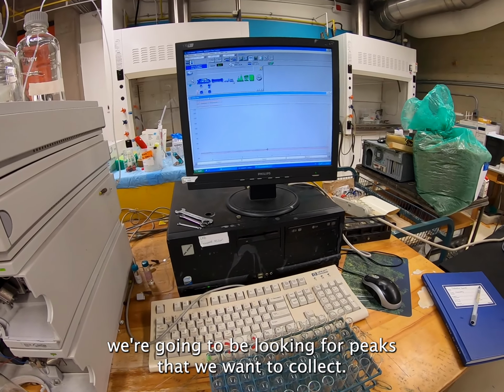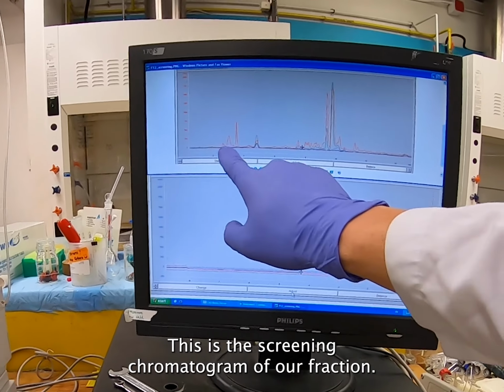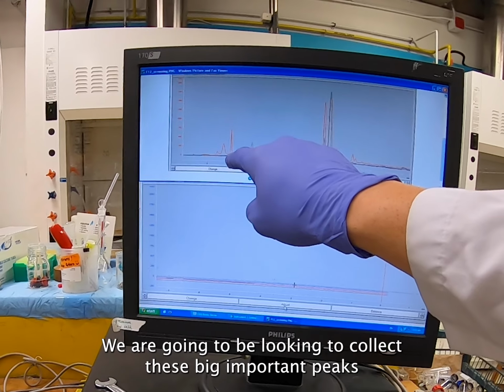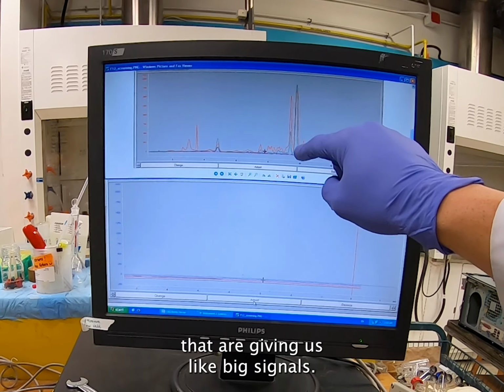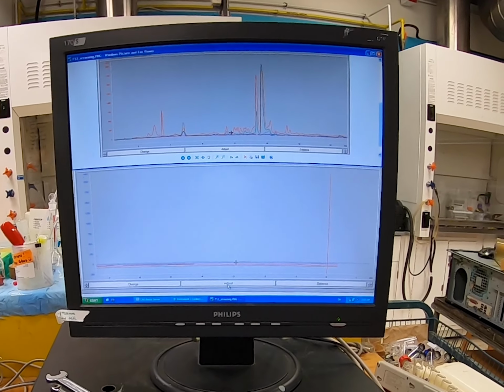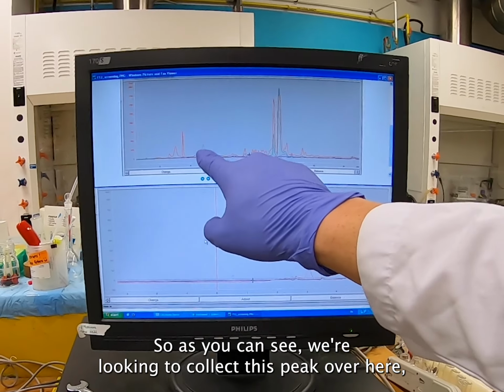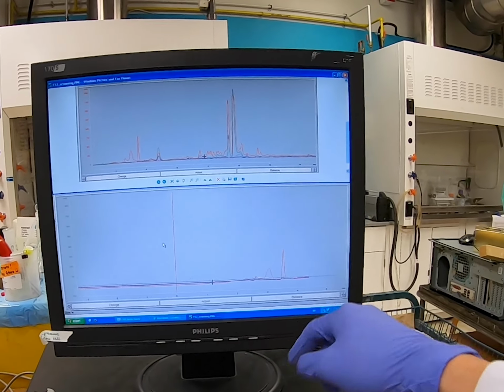And now we're gonna be looking for peaks that we wanna collect. This is the screening chromatogram of our fraction. We're gonna be looking to collect these big important peaks that have given us big signals. They could possibly be compounds that are antimicrobial. So as you can see, we're looking to collect this peak over here, which should be coming out in the next 30 seconds.